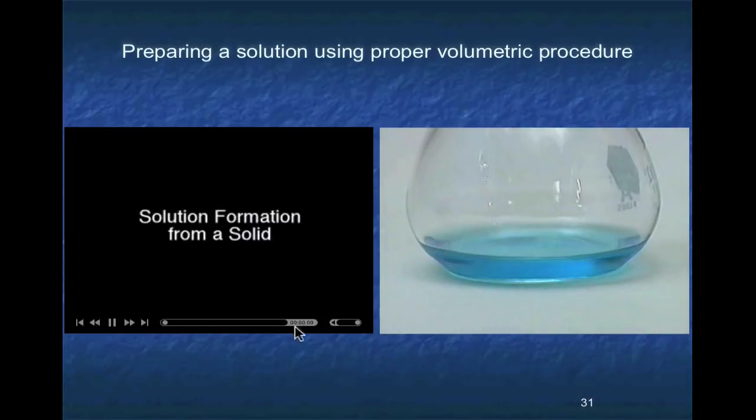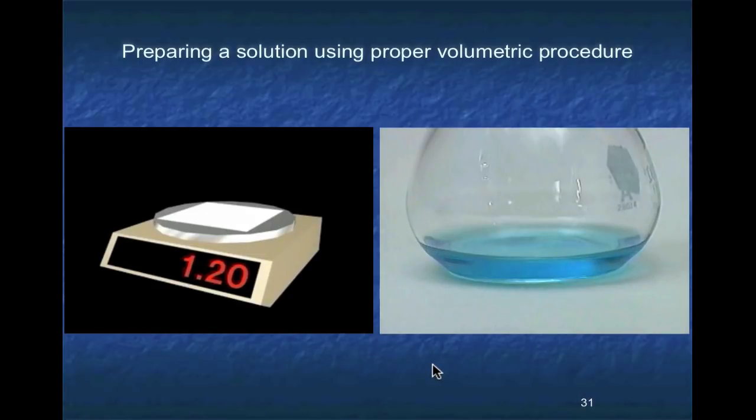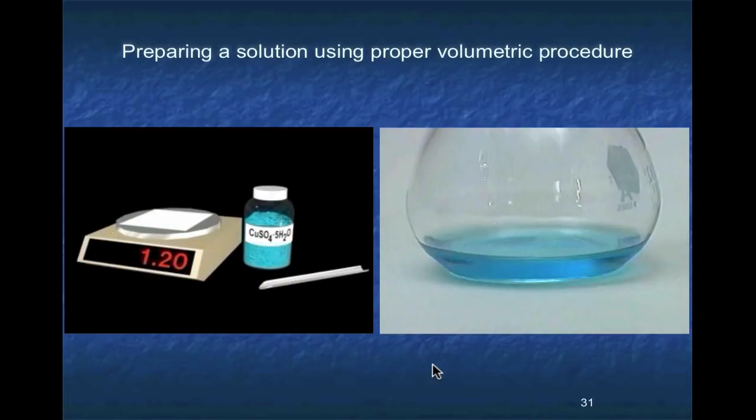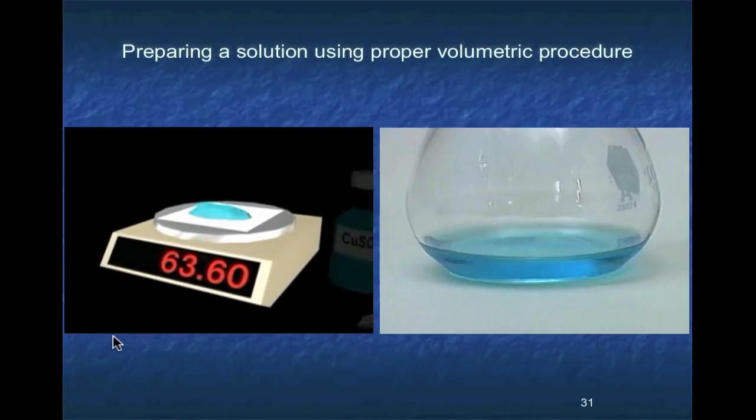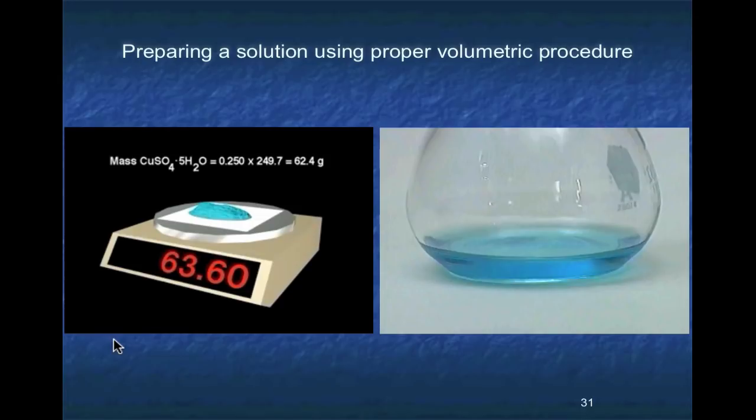To prepare a solution of known concentration from a solid solute, we must first weigh out an appropriate amount of the solid. For example, to prepare 250 milliliters of a one molar solution of copper sulfate, we first weigh out 0.250 moles of copper sulfate. Most commonly, copper sulfate is available as the pentahydrate. The formula mass of copper sulfate pentahydrate is 249.7. We weigh out precisely one-fourth of this mass, 62.4 grams. Note that the weight on the balance is the sum of the paper and copper sulfate.